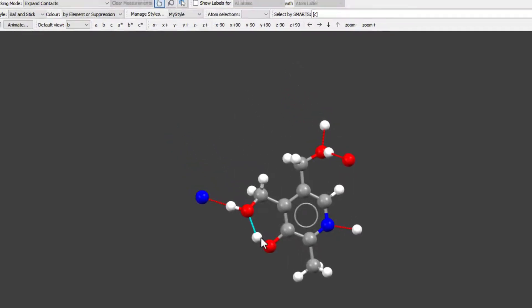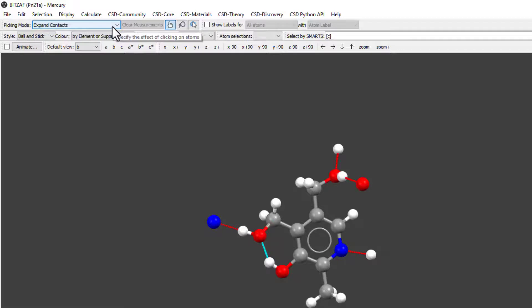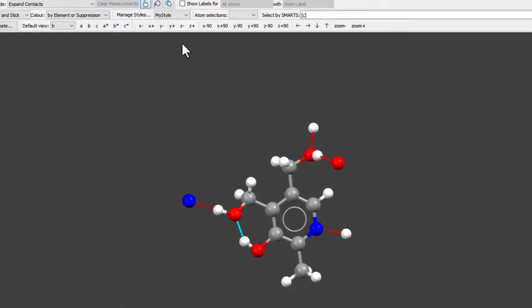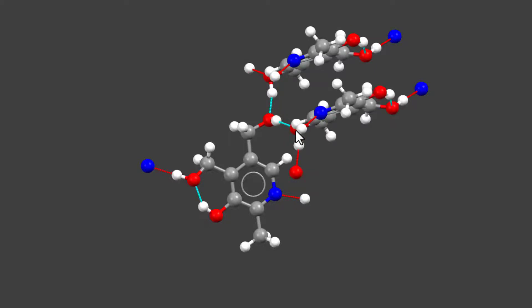We can see at the top right that the picking mode changed to expand contacts. In this mode, we can click on each hanging atom and it will display the full molecule it belongs to.